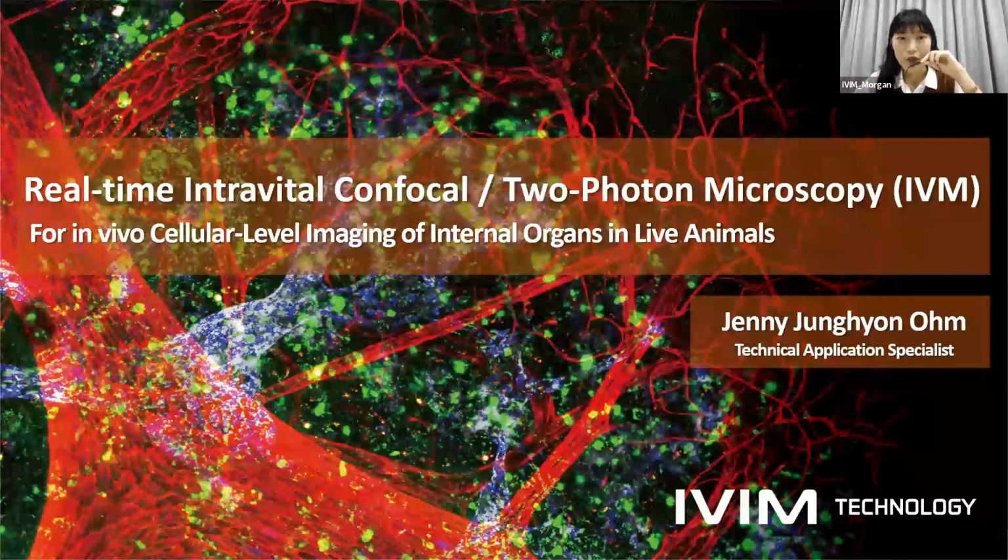In today's session, we'll be discussing real-time intravital confocal and two-photon microscopy (IVM) for in vivo cellular level imaging of internal organs in live animals. We'll explore how advanced two-photon and confocal microscopy enable high-resolution in vivo imaging and reveal cellular dynamics across organs, with application in drug delivery and disease research.